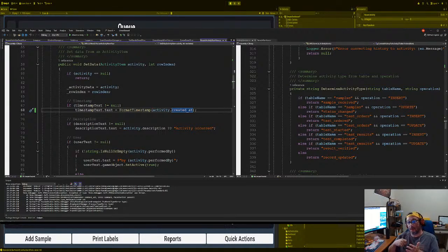Once we finish with the queue, we're gonna fix everything to make sure everything's nice and pretty. Good sizing, good font, good colors, and then we're gonna export it to WebGL and put it up on the website somewhere, my personal site, and that way investors could look at the stuff and all that. But we need to set up WebGL. We need to set up Supabase online, and after those things are done, we need to do some testing, and then we can move this onto the website.